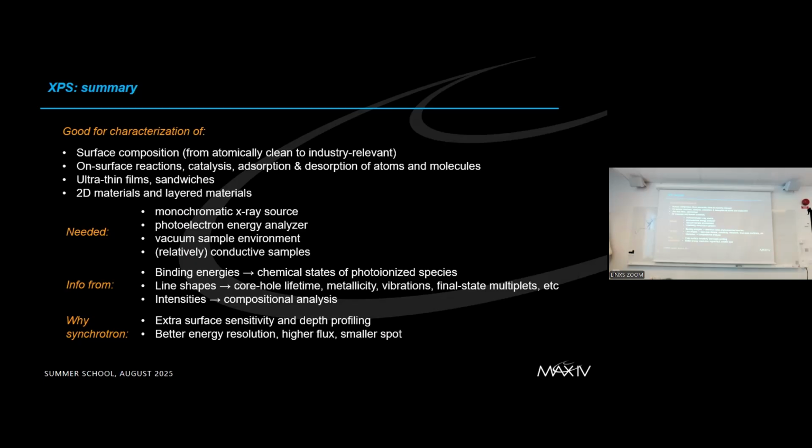if your monochromator would be perfect, so what you type in the computer would correspond to reality 100%, then you would have the perfectly well-defined photon energy. And then if your analyzer is measuring kinetic energies also exactly, then it will give you the exact kinetic energy.